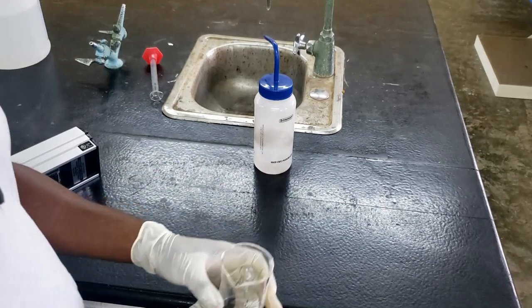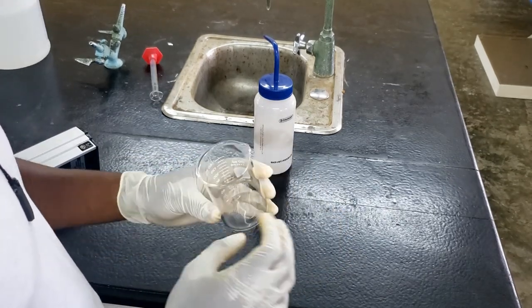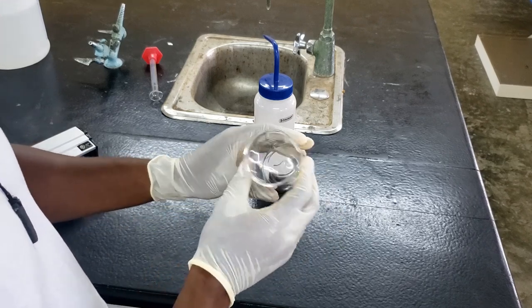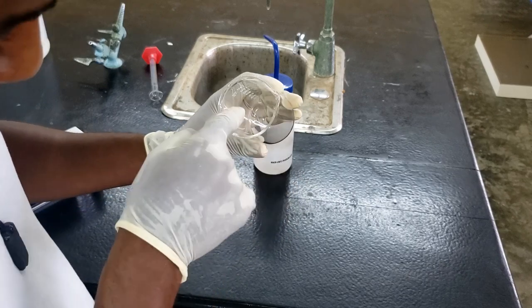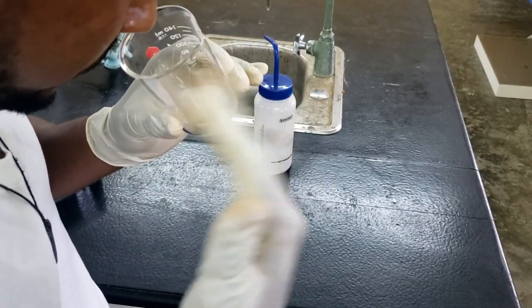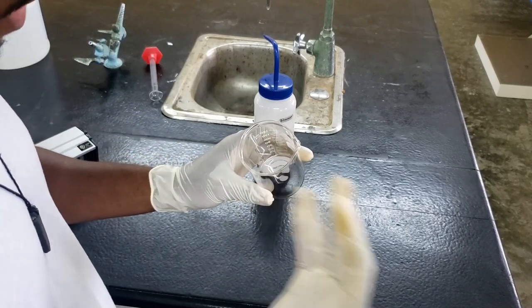Now we've evaporated off all that eluent. This was from the p-bromonitrobenzene. Now it's going to be a bit hard for you to see, but there's a bit of residue that's left inside the beaker. And if you smell, it gives that same sweet smell that we had before from the p-bromonitrobenzene.